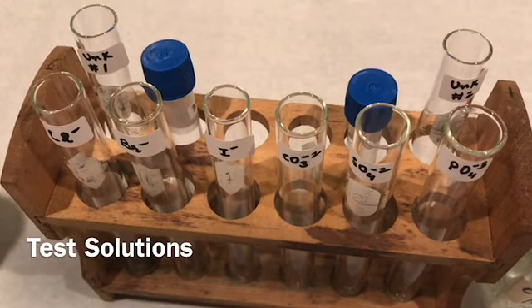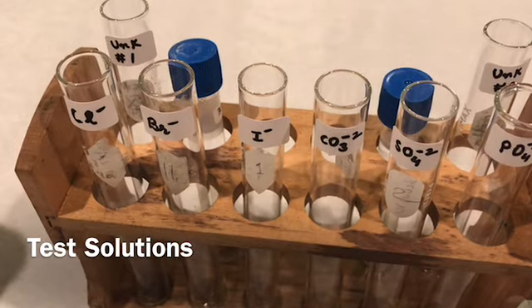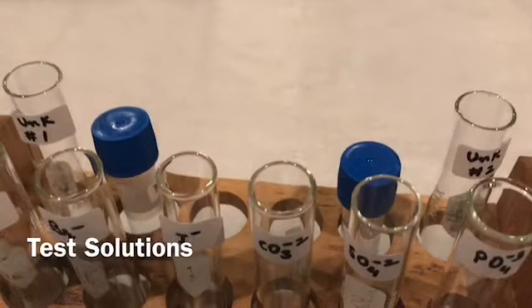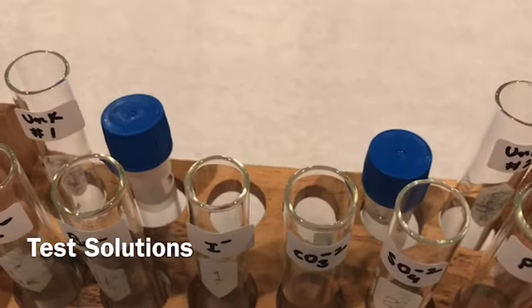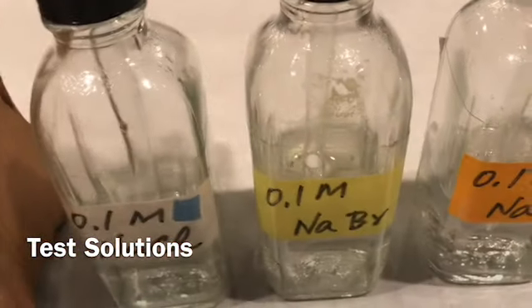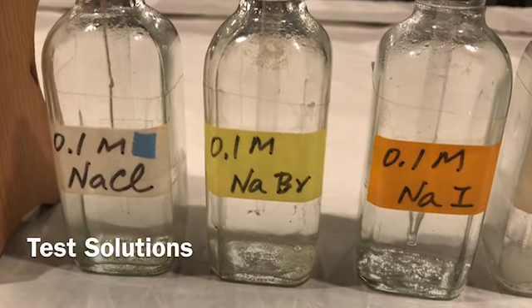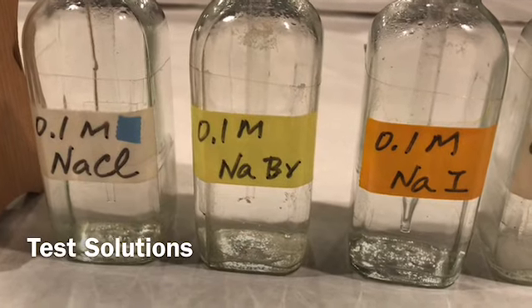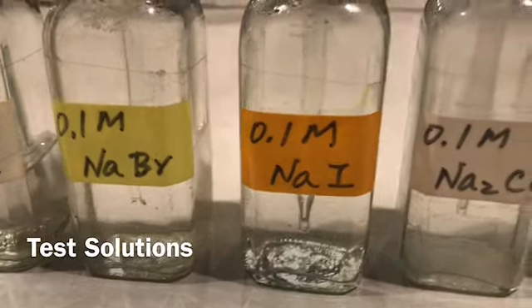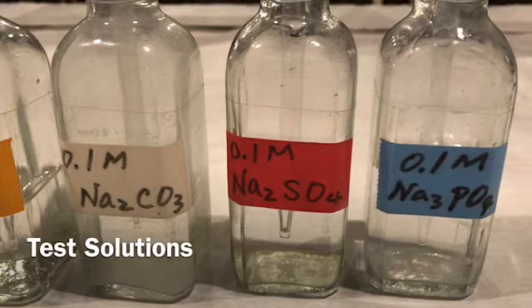This is the setup for the test tube rack, having the different test tubes for different anions: chloride, bromide, iodide, carbonate, sulfate, phosphate, unknown number 1, unknown number 2, and these 2 are the blue cap tubes. They are the reservoir tubes for the unknowns. And here are the test solutions for different anions: for chloride, sodium chloride; for bromide, sodium bromide; for iodide, sodium iodide; carbonate, sodium carbonate; sulfate, sodium sulfate; and the last one for phosphate, sodium phosphate.